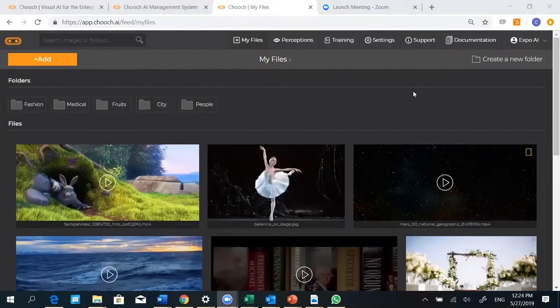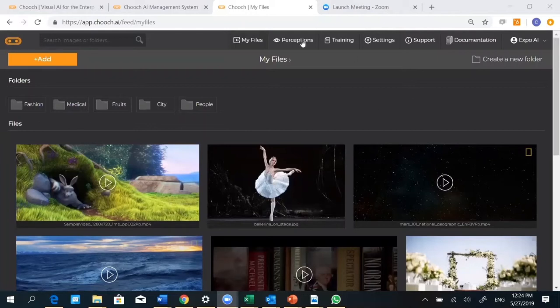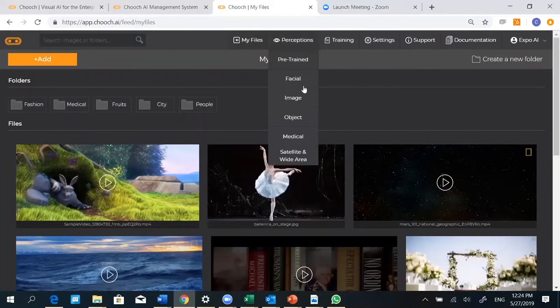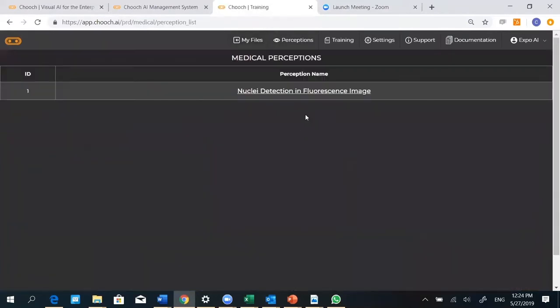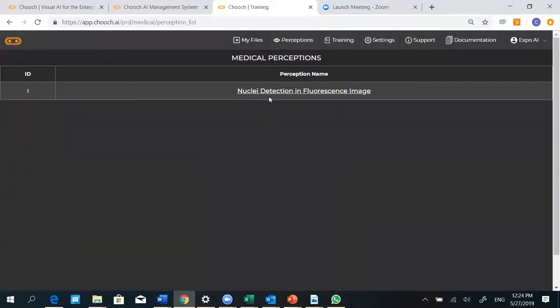Hi, welcome to Chooch. Today we're going to talk about cell detection and cell counting. When you land into Chooch, go to Perceptions, under Perceptions go to Medical, and here you see perception names. Go to Nuclei Detection.